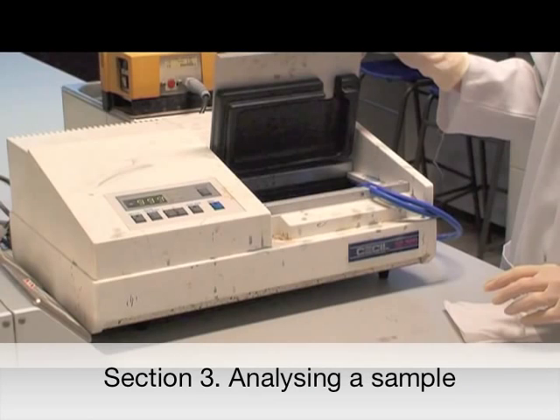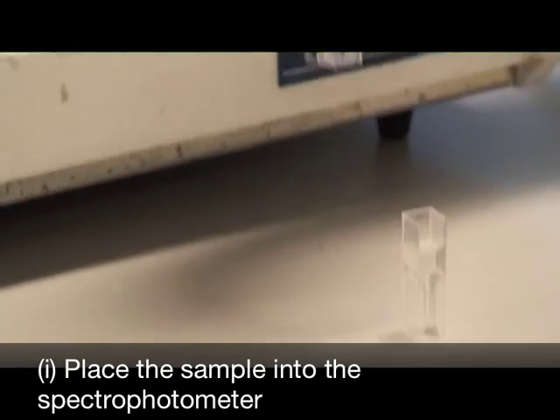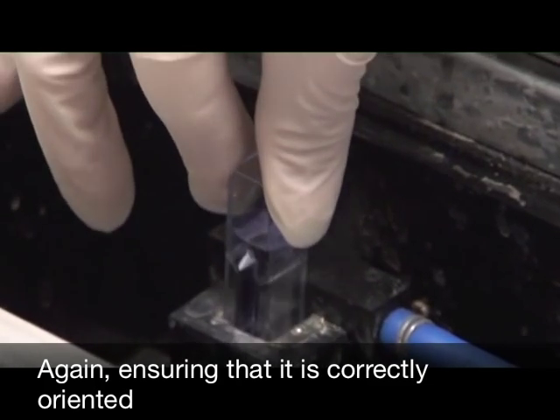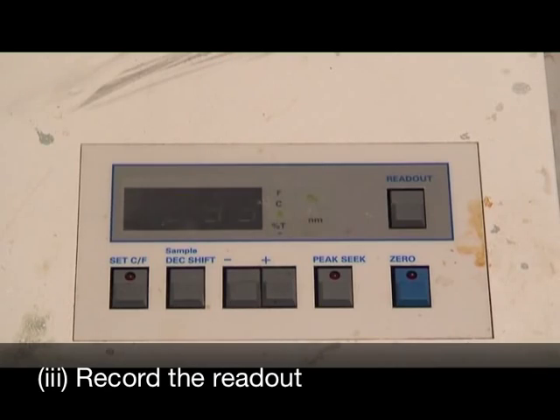Section 3: Analyzing a sample. Place the sample into the spectrophotometer. Again, ensuring that it is correctly oriented. Close the lid and record the readout.